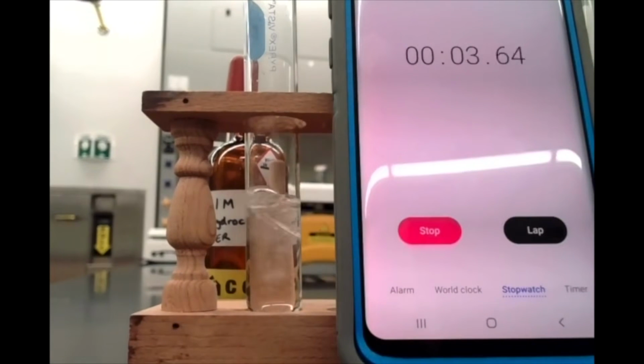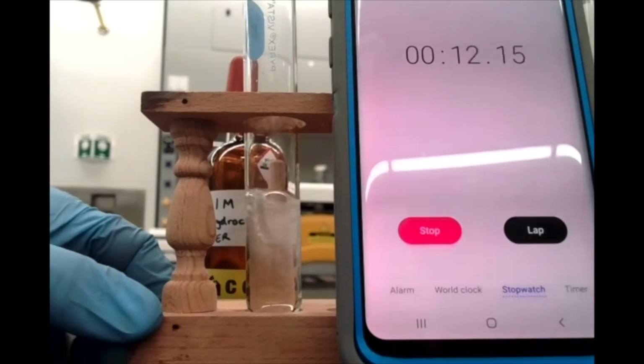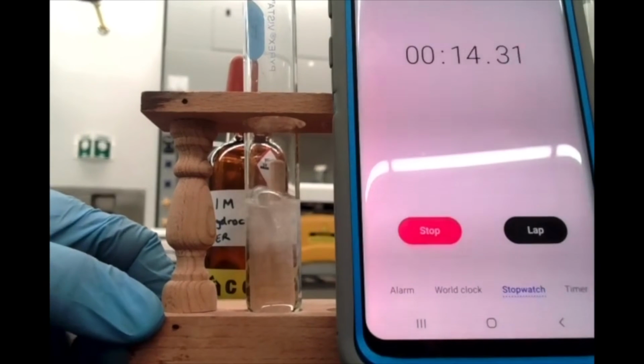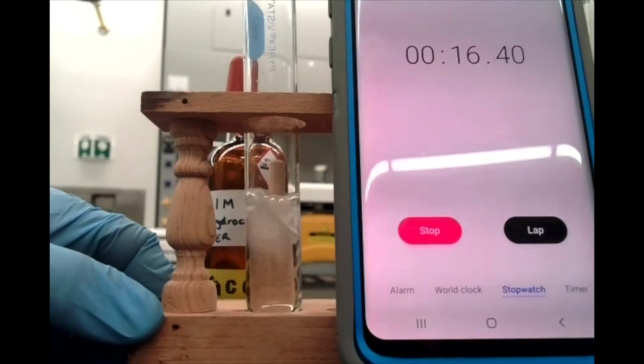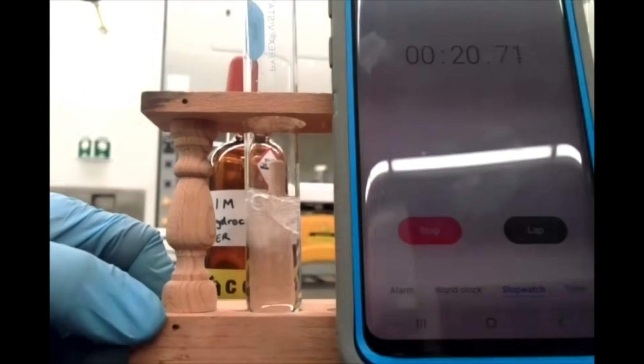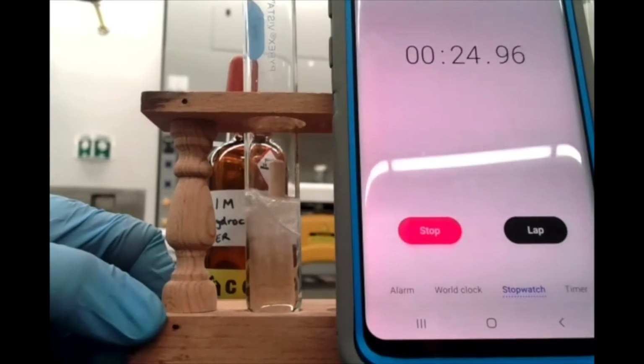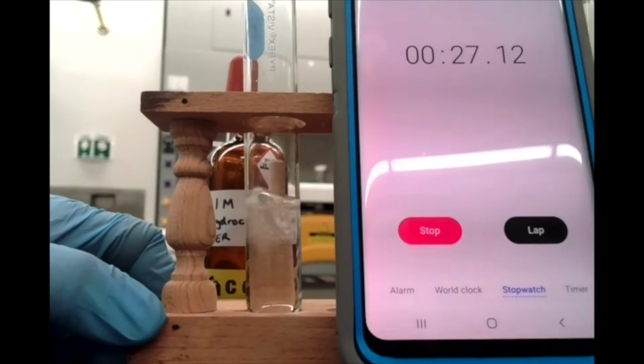Okay, you can see the hydrogen gas that's bubbling from there, that's being produced as the magnesium displaces the hydrogen in our hydrochloric acid. So keep an eye on that, and again, make a note of the time at which all of the magnesium has disappeared, and basically all of your magnesium has been converted into magnesium chloride, and the hydrogen in your hydrochloric acid has been converted to hydrogen gas.